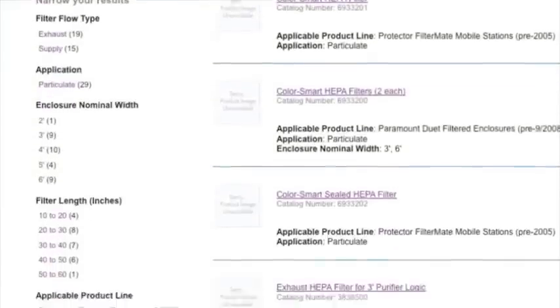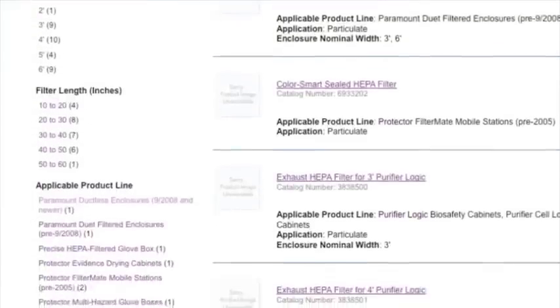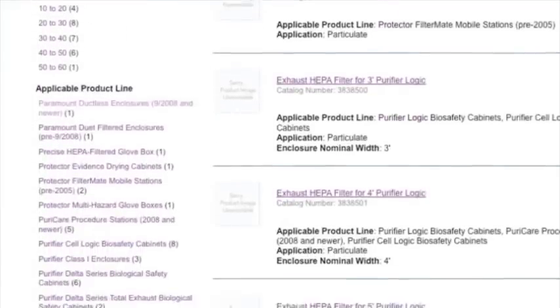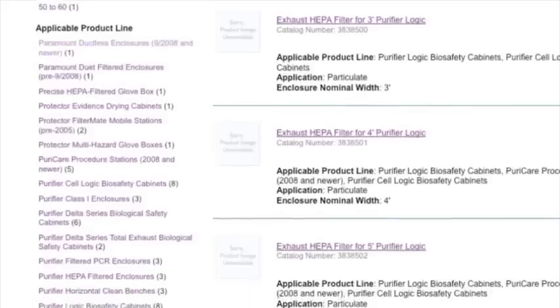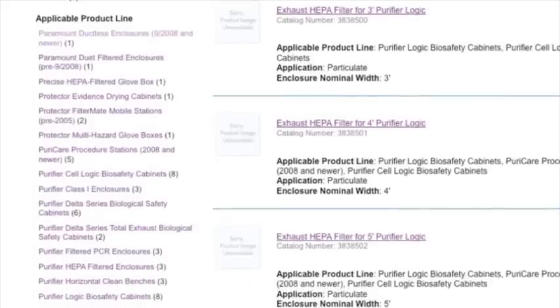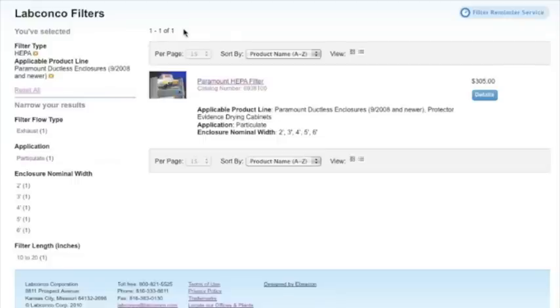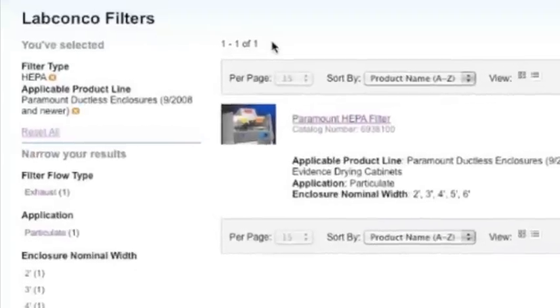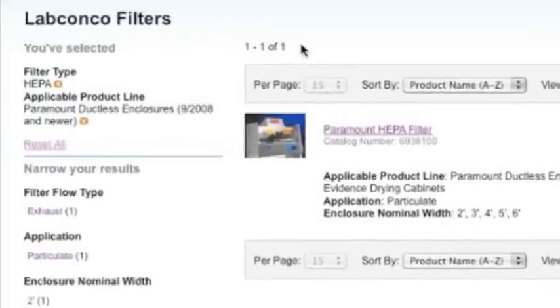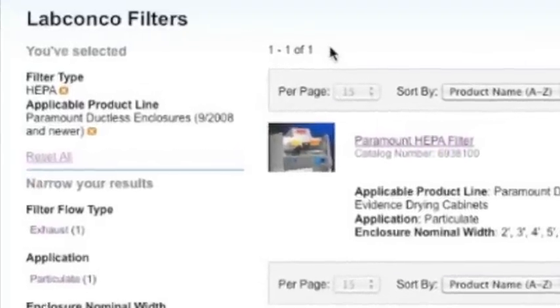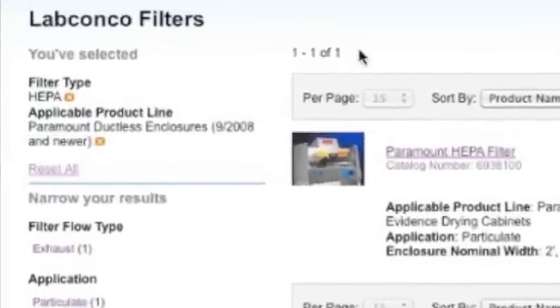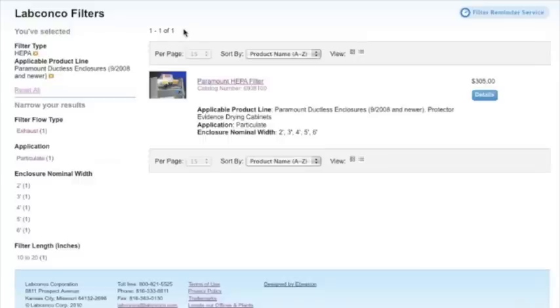Since multiple search criteria can be used, scroll down and select Paramount Ductless Enclosures as your applicable product line. This narrows the 29 HEPA filters down to only filters that can be used on Paramount Ductless Enclosures, which reduces the results to just one filter.